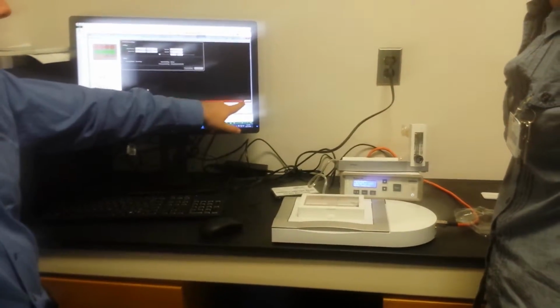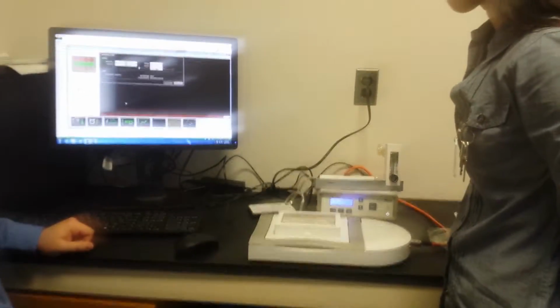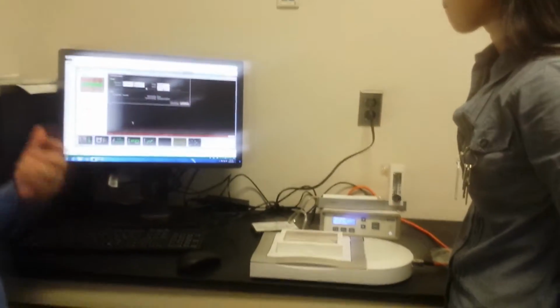At the bottom, this is how long it's been recording for. This is how long it's been playing for. With this recording scheduler, you can set it up to say, record 5 minutes every hour for X number of hours, and it'll just continue going.